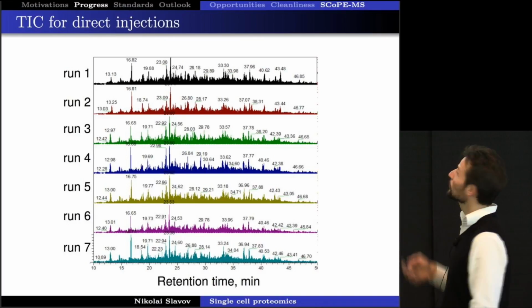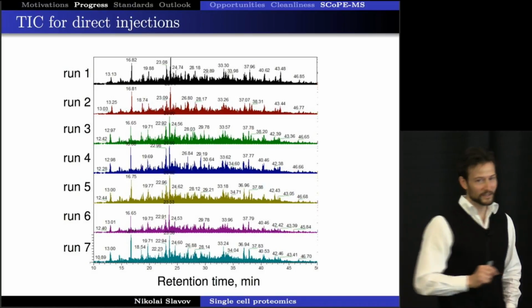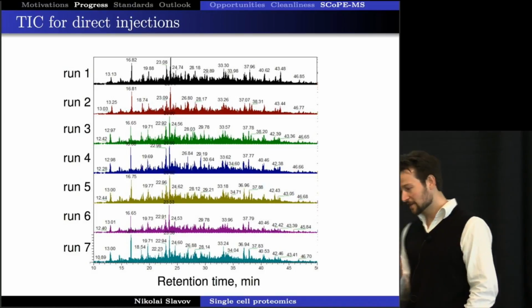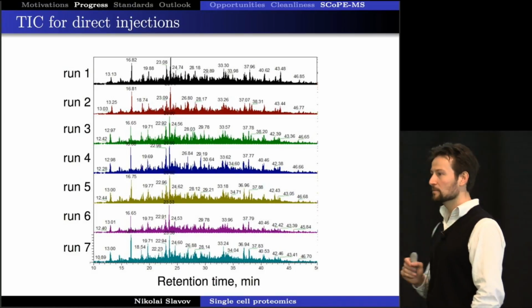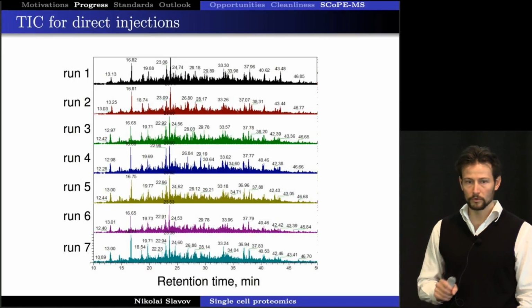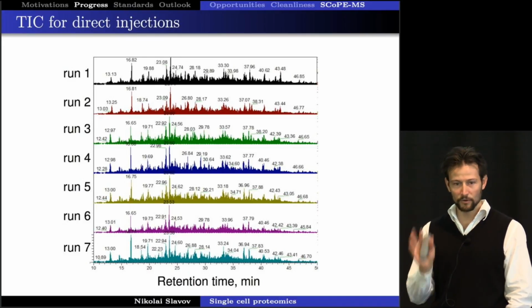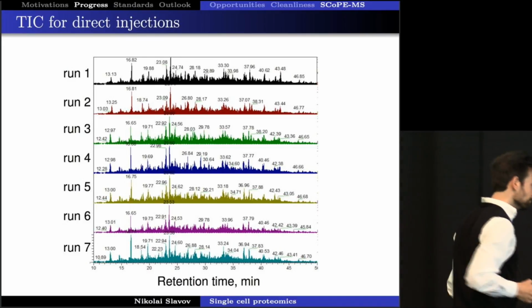I'm showing here the total ion current, aficionados know that. So I was very delighted that we can actually have a sample prepared without cleanup that is clean enough to be injected via direct injection, therefore no losses. And that this thing worked day after day, week after week, without having to replace anything.